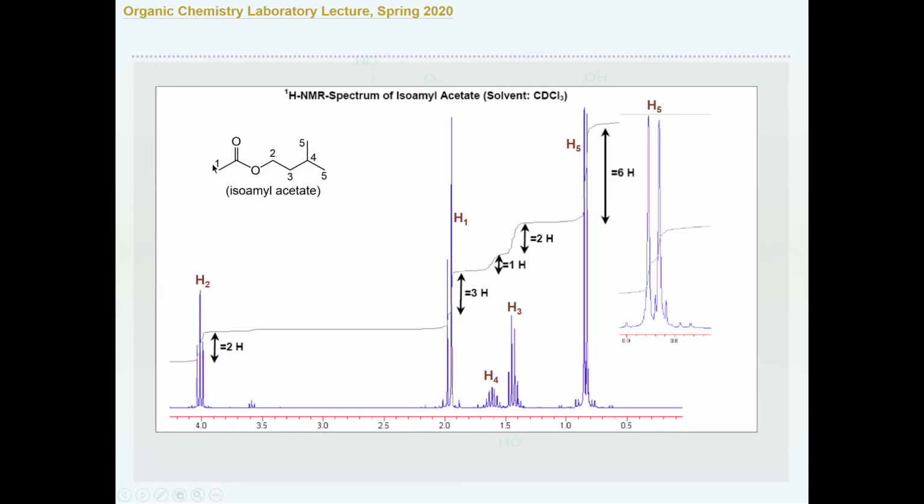And there's no other proton right next to it, because the most nearby proton is far away, already two atoms away. That's too far. There's no coupling at all, so it's only a single peak. So it will be a singlet, and the NMR machine's integration will tell you it's 3 protons. So that'll be 3 protons matching with the CH3.